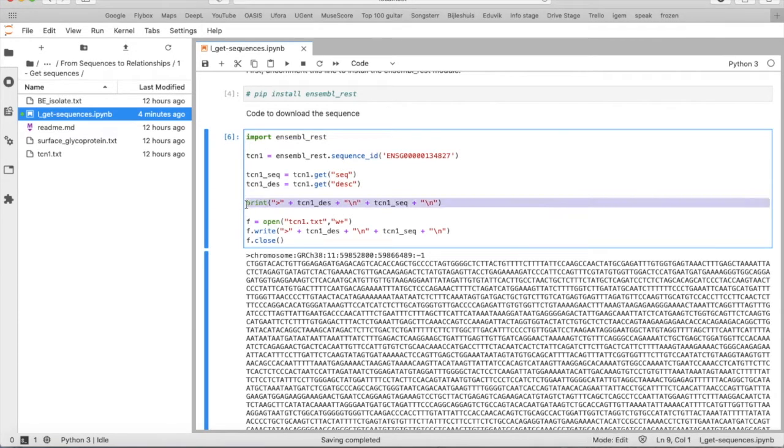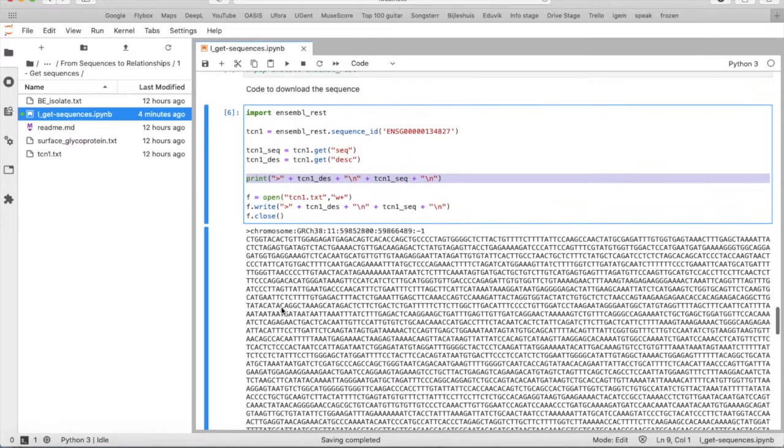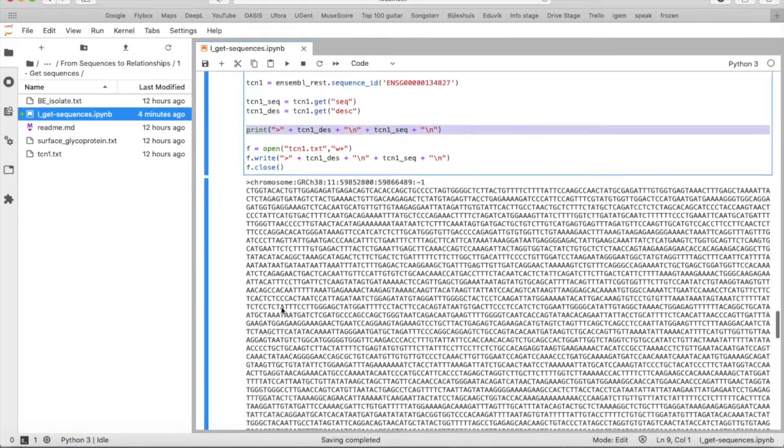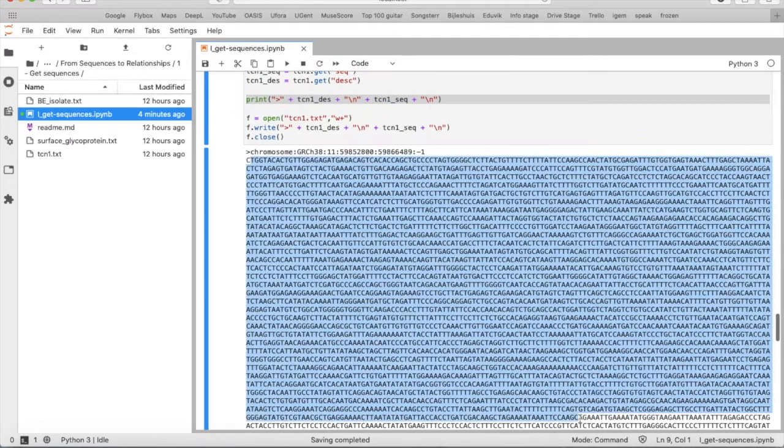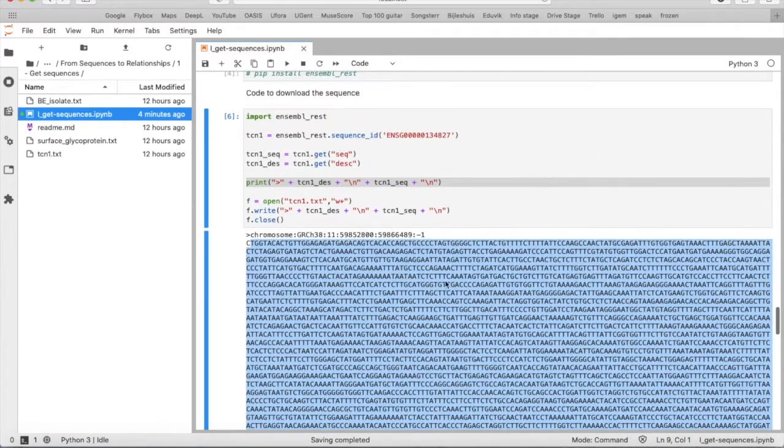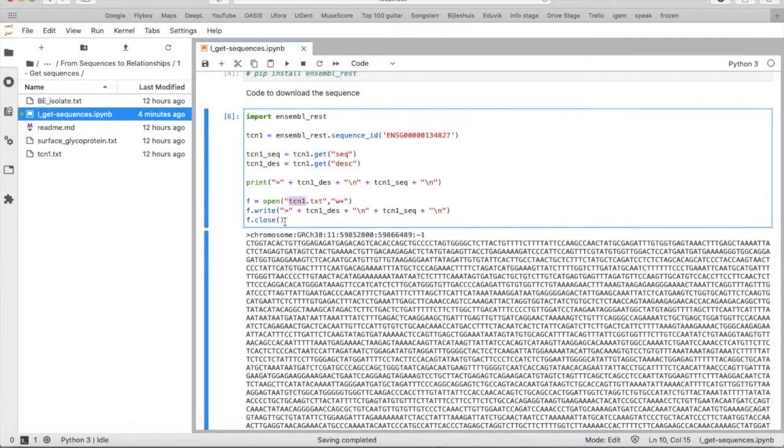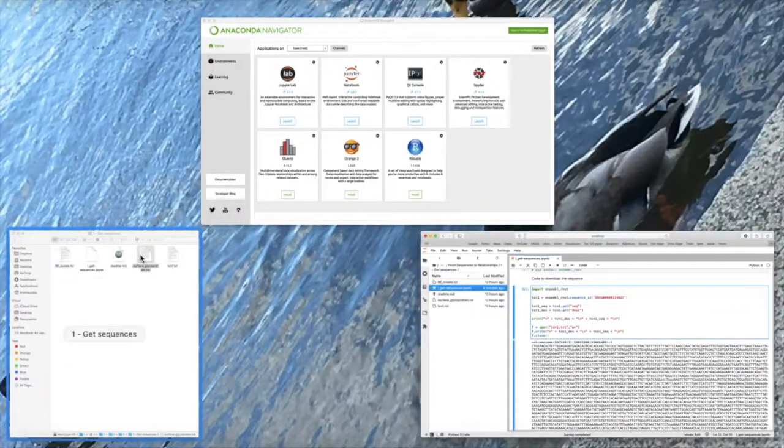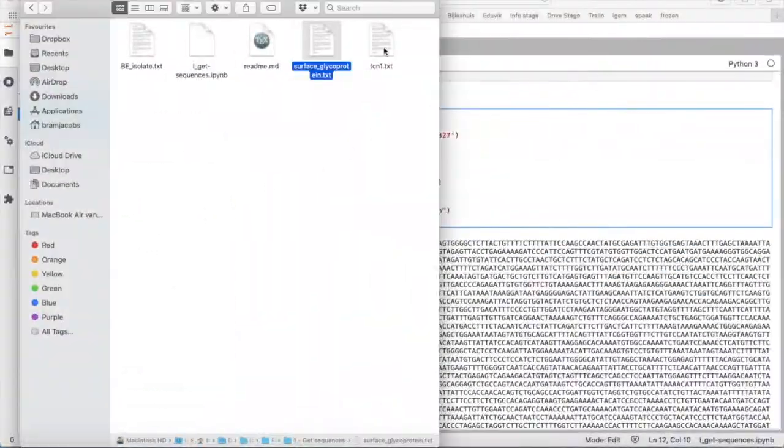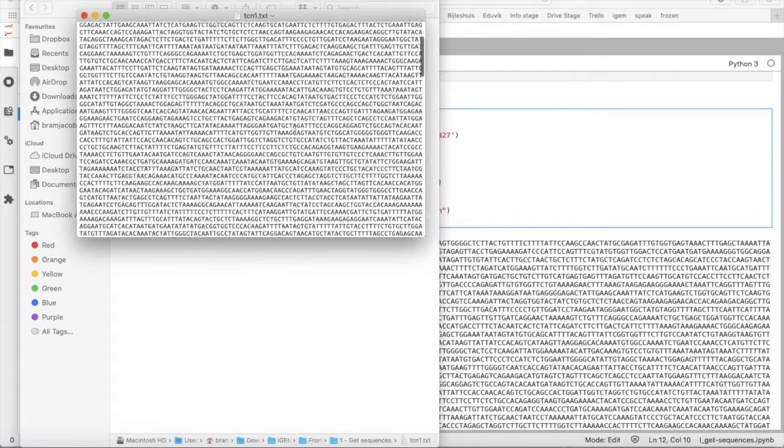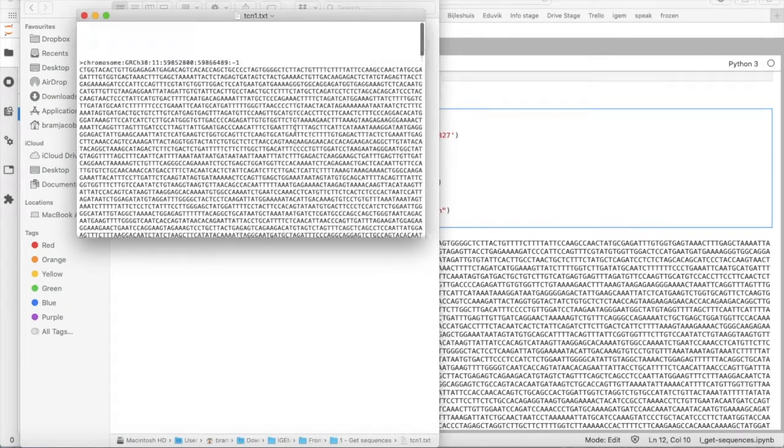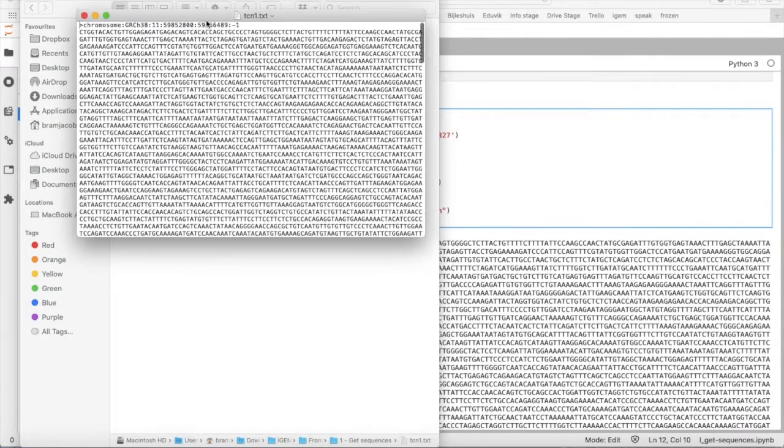Then we can use this line to print the description and sequence like this. Now we can also save the sequence as a FASTA file. If you execute this code you will also get a txt file with the complete sequence and a description.